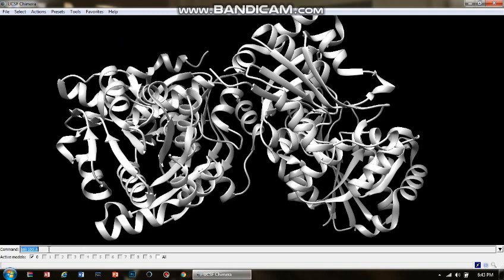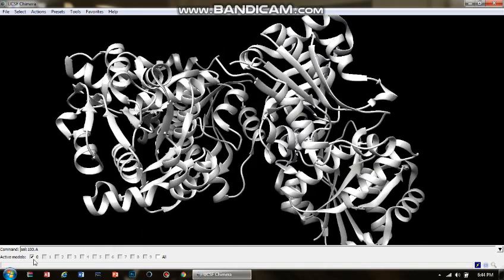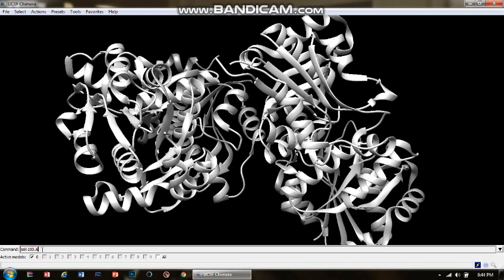It opens right here. As you can see, the second line says Active Models. In case you are analyzing two models at a time, or analyzing the complex of a ligand and protein, you have more than one model active. Right now I am analyzing one single protein molecule, so model zero is active.